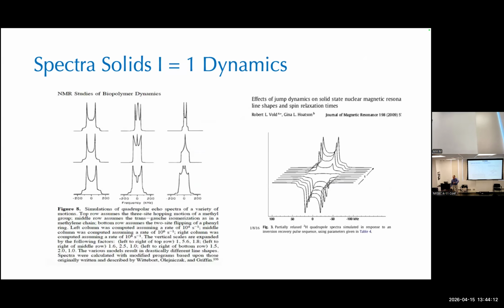But what I wanted to emphasize before I stop around the problem session, yes, please. Why is the Q low on purpose? Yeah, so that you don't have such a long ring down, yes. How do you do it?